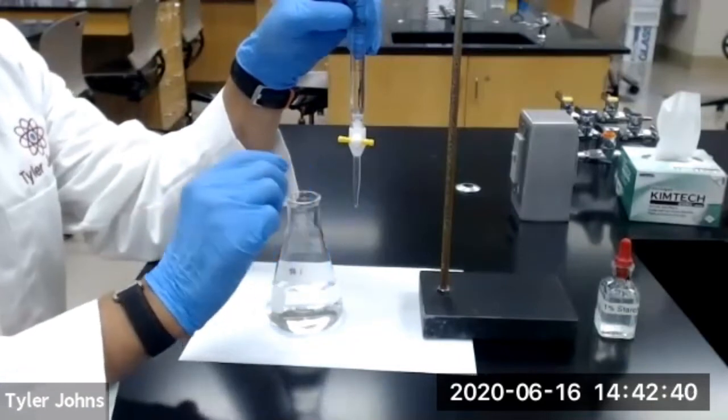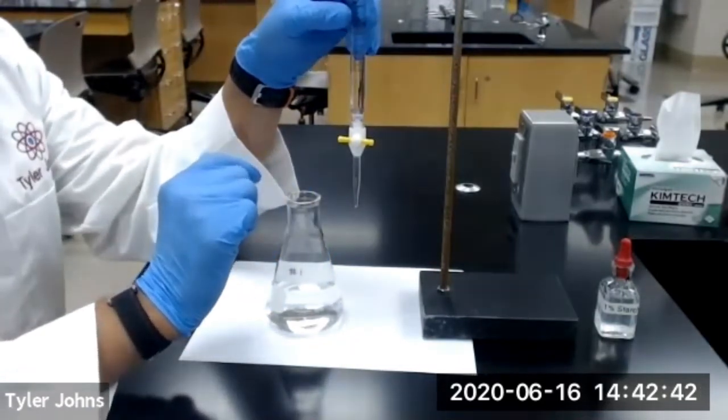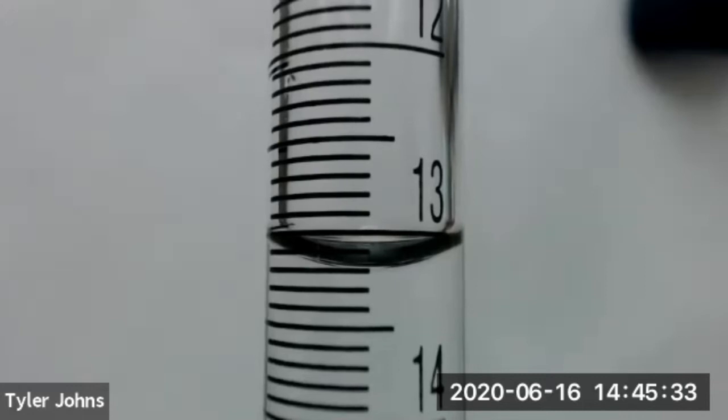We now need to record the final burette reading. This is the final reading on our burette after reaching the endpoint for trial number 1 of our titrations. Note that it is just over 13 milliliters, but be sure to record the correct number of significant figures.